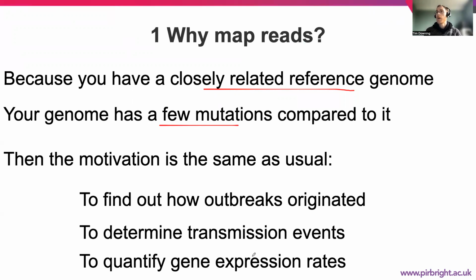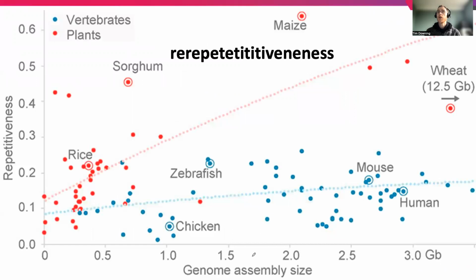And our central problem with read mapping is the same as usual: a lot of the genomes we deal with, even if they're very, very short, can be repetitive. So there can be small repeats that occur in the genomes, and therefore, if we're mapping reads from one sample to another, we have to bear in mind that there'll be some small differences between the genomes, and those structural changes can mean that reads map in an unexpected manner.